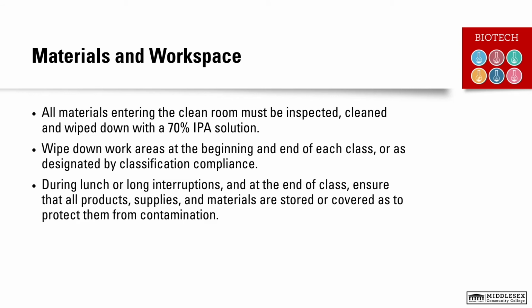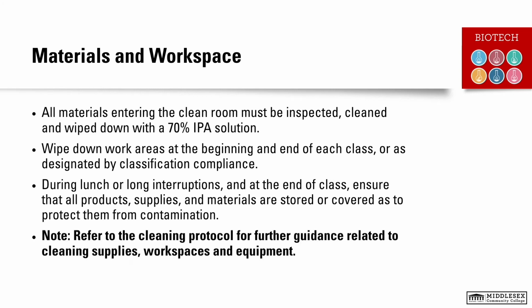During lunch or long interruptions, at the end of the class, ensure that all products, supplies, and materials are stored or covered as to prevent them from contamination. Refer to the cleaning protocol for further guidance related to cleaning supplies, workspaces, and equipment.